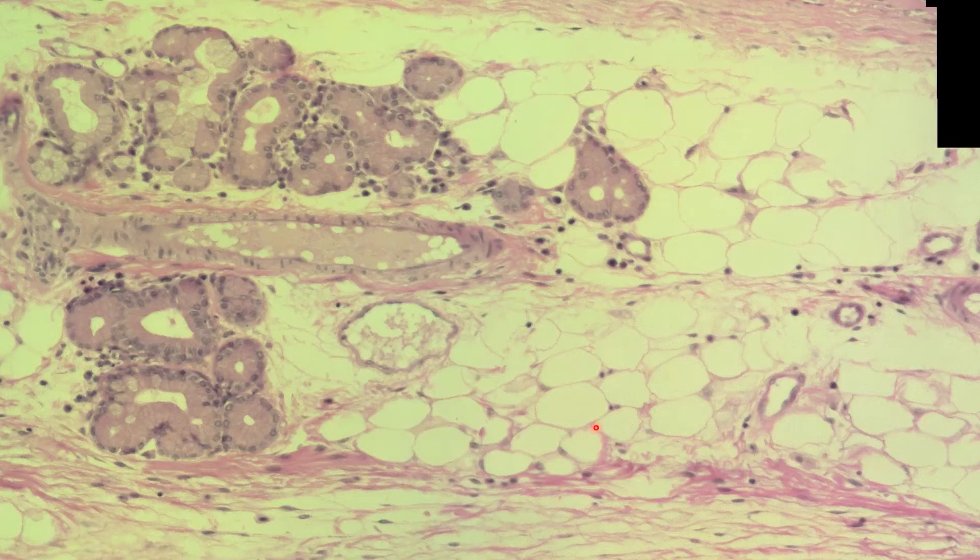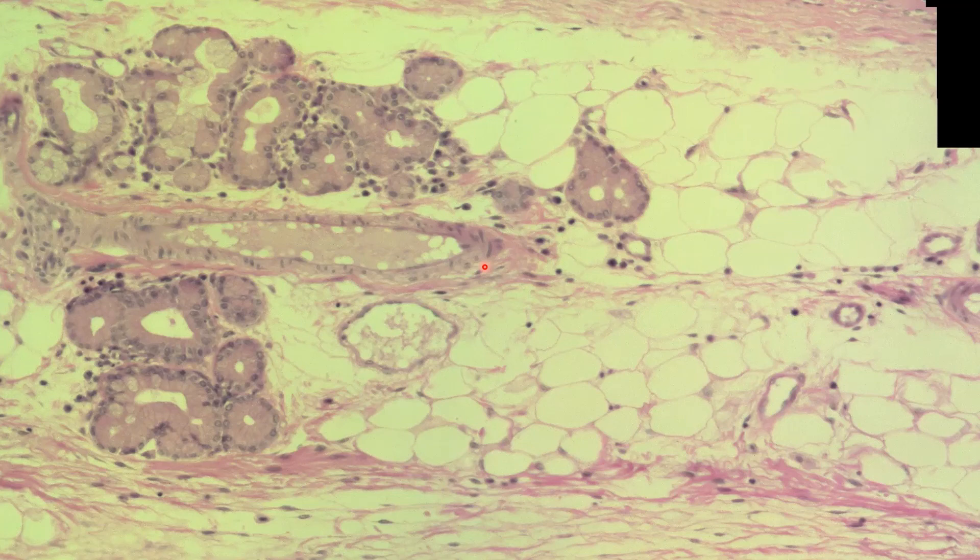Now, while we're here, I'll point out, if you look at this lining here, this is also a bunch of pancake cells that are lining a blood vessel, so this is also simple squamous. And you can see it really looks nothing like adipose, so the only time I would expect you to confuse simple squamous with adipose would be like that example you saw in the lung.